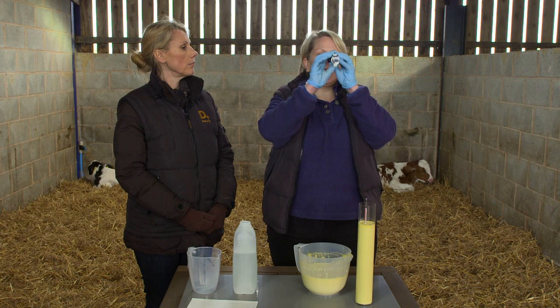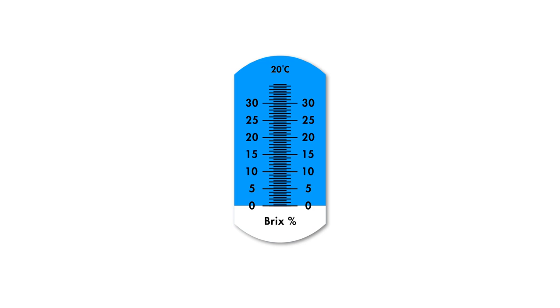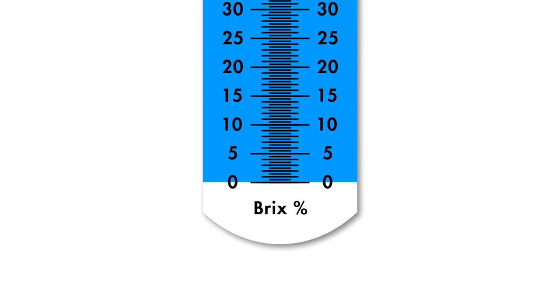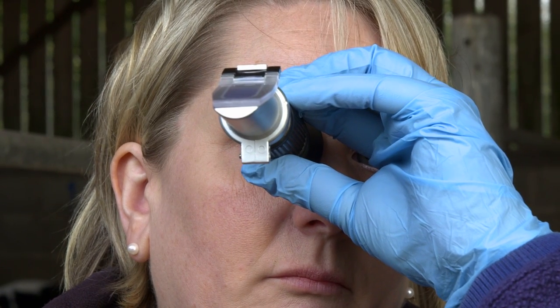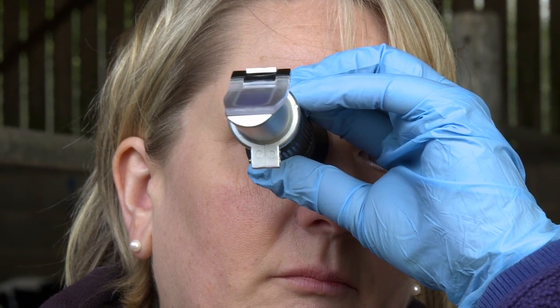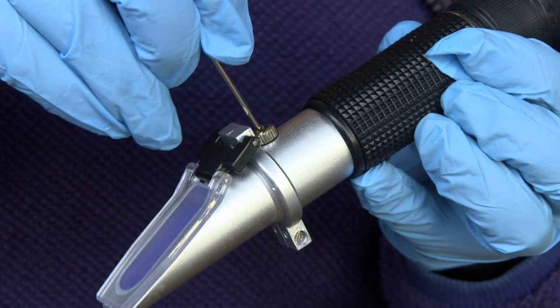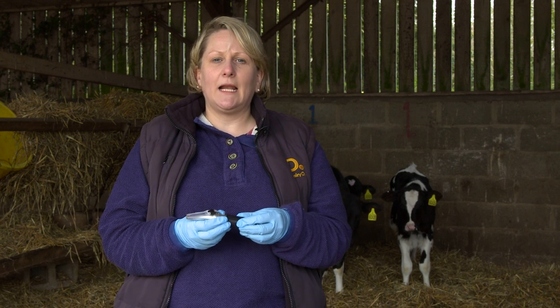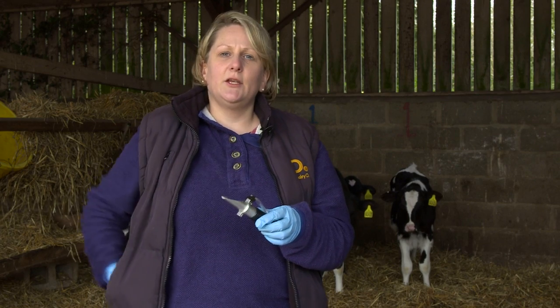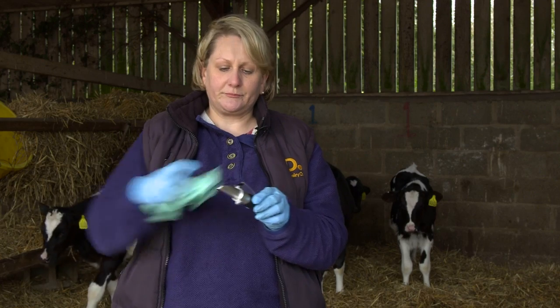This is done by holding the eyepiece up towards the light. You'll see the circular field with graduations down the centre. You may have to focus the eyepiece to see the graduations clearly. The scale should read zero. This is determined by looking at where the light and dark areas meet. If the scale does not read zero, you'll need to adjust the refractometer. Turn the calibration screw until the boundary between the upper dark and lower light areas meet exactly at zero on the scale. Once you're happy the refractometer is correctly calibrated, wipe clean the surfaces using a clean, dry tissue.